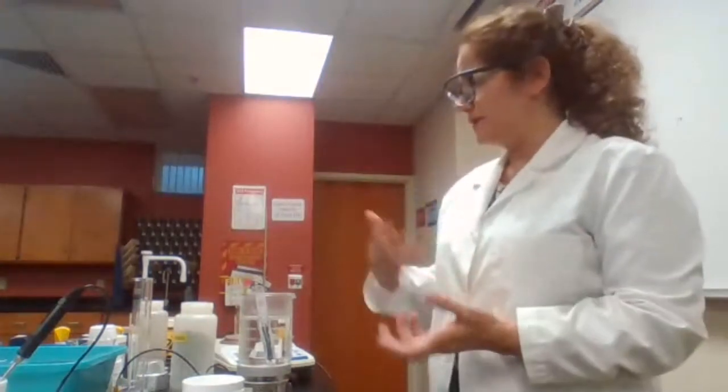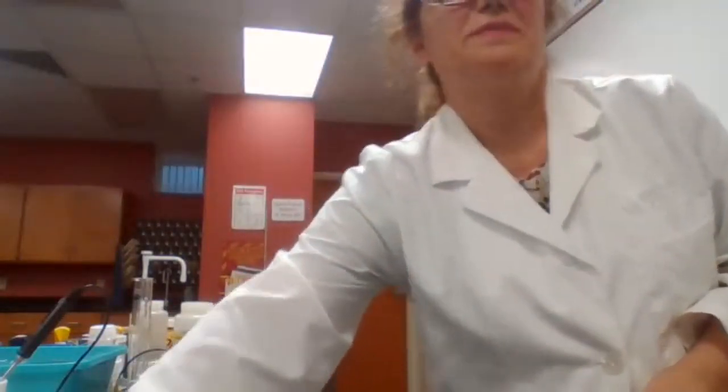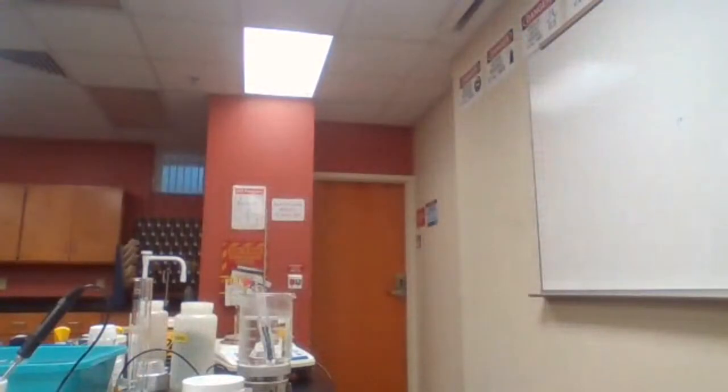Do you have any questions while we are waiting for 5 minutes, or should I get ready for the next chemicals for the next steps? Professor, a question. Sure. The time that you want to do the water, is that E? Is that the time or the temperature? The time is not recorded there. That time is based on the procedure. But let me go to the data sheet.